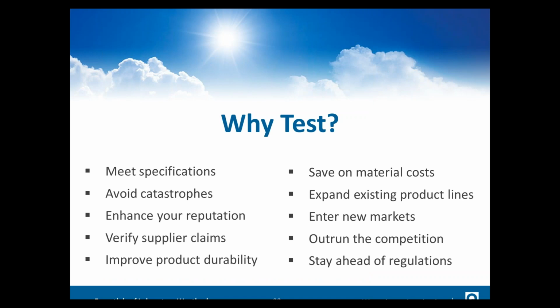There's lots of different reasons why people might perform laboratory weathering. You might be looking at developing a new material, and maybe that new material needs to be more durable, or maybe you need that new material to have a lower cost. Maybe you have to meet a specific specification to be able to supply a product, or maybe you need to verify that somebody who's supplying you a product is actually meeting the claims that they're making. It also helps enhance your reputation. And in the case of some environmental regulations, you can stay ahead of them and develop new formulas that meet the strict environmental requirements while still maintaining the necessary durability for that application. So there's lots of different reasons why you might test.